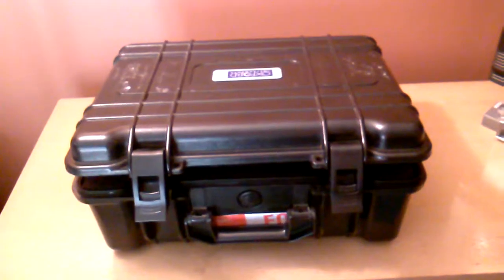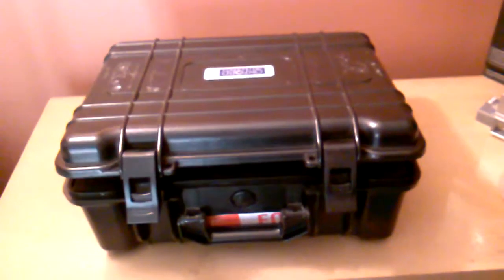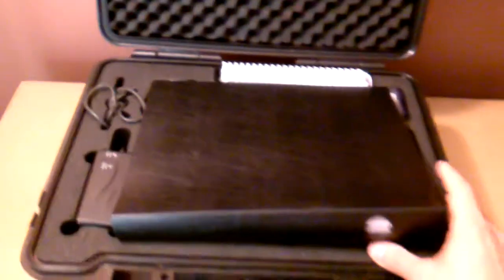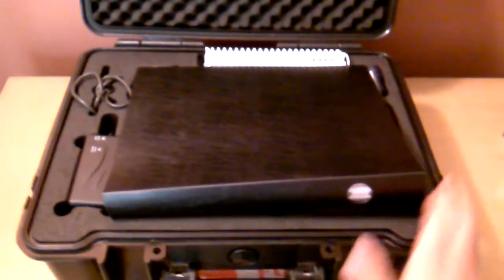Eastern Applied Research, a distributor of Oxford Instruments handheld x-ray fluorescence equipment. Looking at the demonstration model that we just received in.